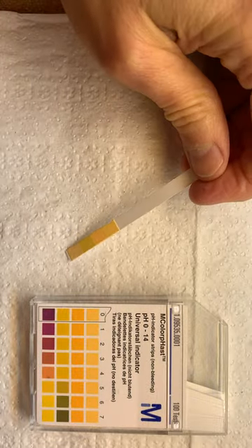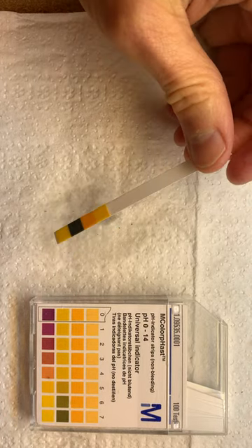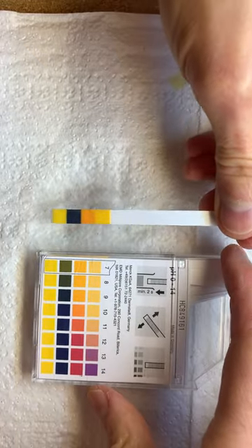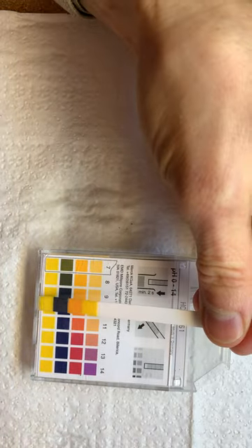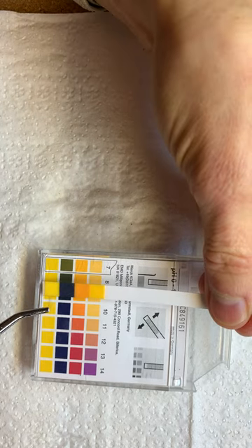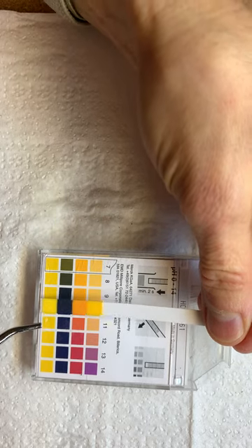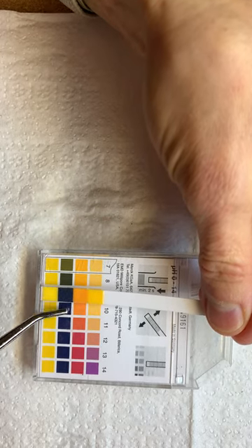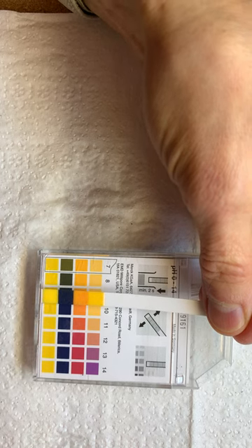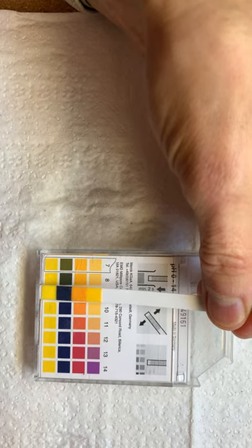Let's spray some in here. All right, we need to get back to our base side and our heavy cleaners here. So now we're looking at about a 10 going into 11 — maybe 10 and a half right there. This one matches the 10 column pretty well. 10, 10 and a half, something like that. That's for Cavicide, which is just a hospital grade disinfectant.